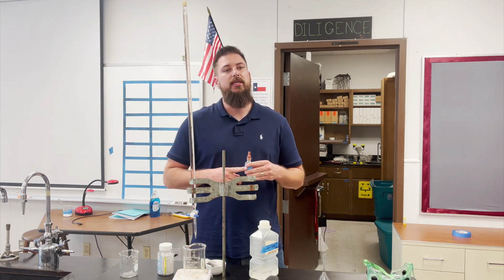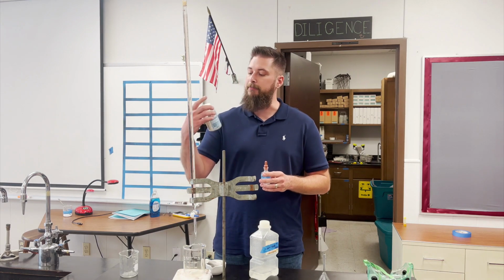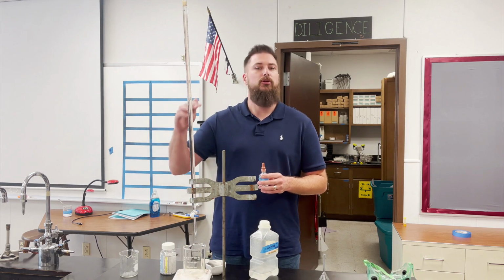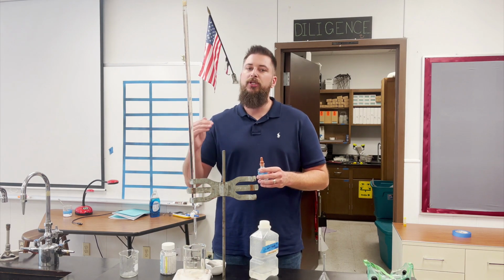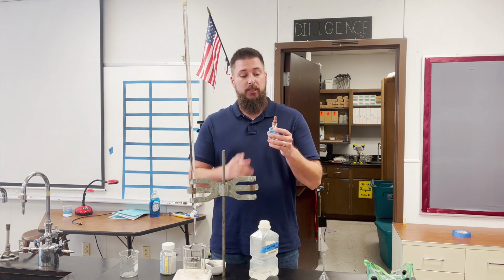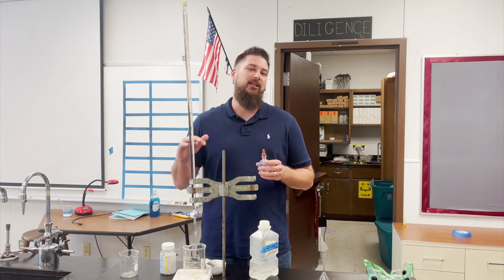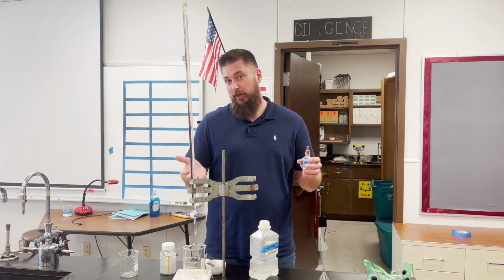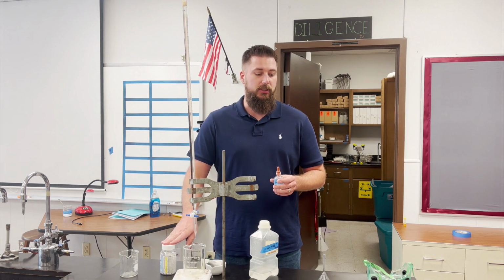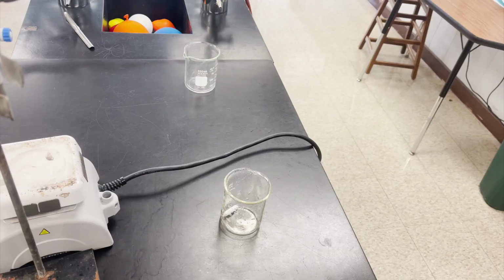Now, the phenolphthalein is our indicator that we're going to use today, and it's a really great indicator because this aspirin happens to be a weak acid, and so we are titrating a weak acid with a strong base. If you remember from the titration notes, that shifts the endpoint, or the equivalence point, up. The phenolphthalein will change to pink at a pH around 8.3, which is pretty close to where the endpoint is going to be. That's why we choose phenolphthalein. Let's go ahead and get started here.